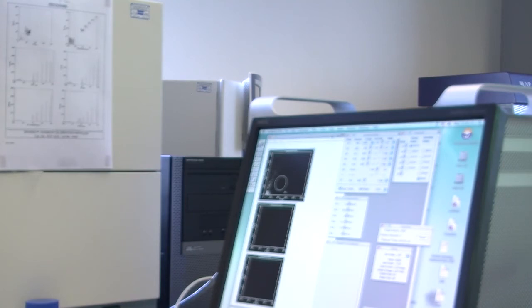So hopefully by the time that you run the suspension, we'll have something to see and have some nice data. Yes, and after we'll have the labels. Yep. But the main one is to check yourself. So add PBS, resuspend, and transfer.